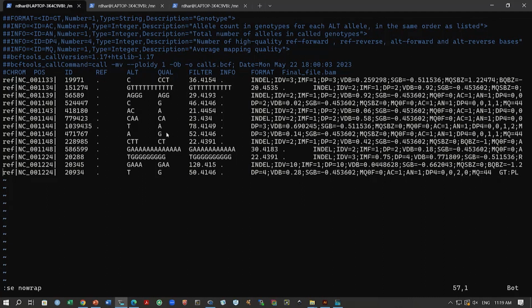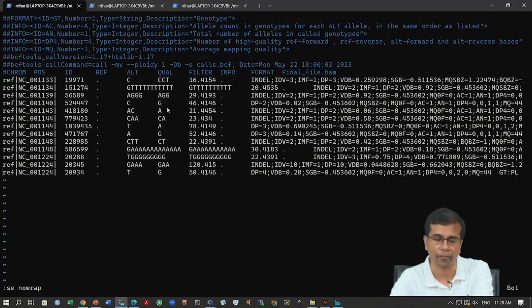You have all these interesting variants around here, and there are a lot of indels, and then there are some SNVs. You can see these SNVs here, T2A or A2G, and their positions and the chromosome are given. What we will do now is go to the integrated genome browser and open up this alignment, and see whether we can actually see this variant, and whether it is an artifact of alignment or not.